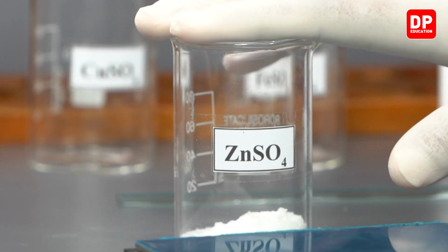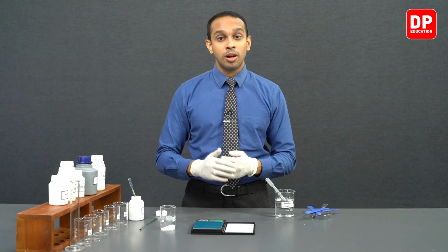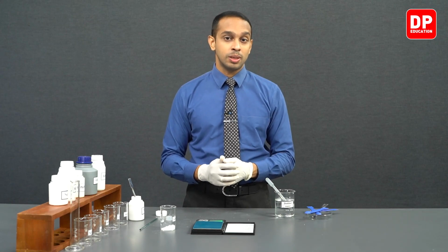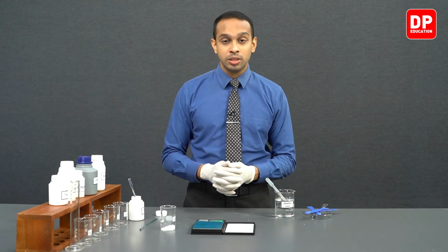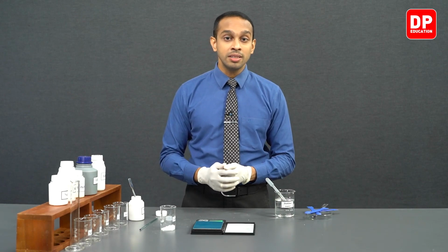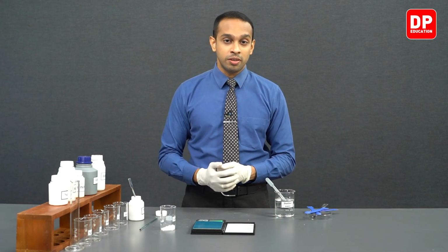However, students, in this particular experiment, we are trying to prepare a solution of zinc sulfate and all the other sulfates and nitrates in the experiment, roughly to a concentration of 1 mole per decimeter cubed. Since this is not a reaction where we are going to titrate these solutions against anything else, we are not going to be preparing these solutions with the use of a volumetric flask. We are going to need solutions with a concentration of roughly 1 mole per decimeter cubed. So therefore, we will not be using a volumetric flask here.